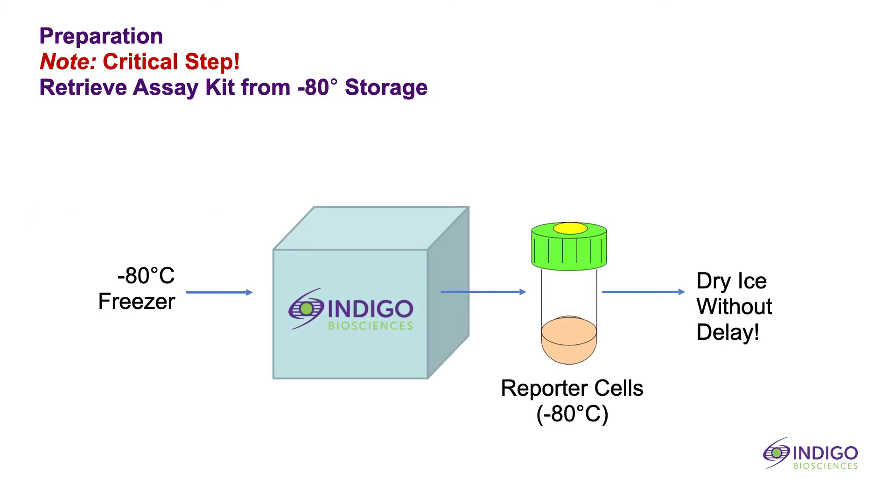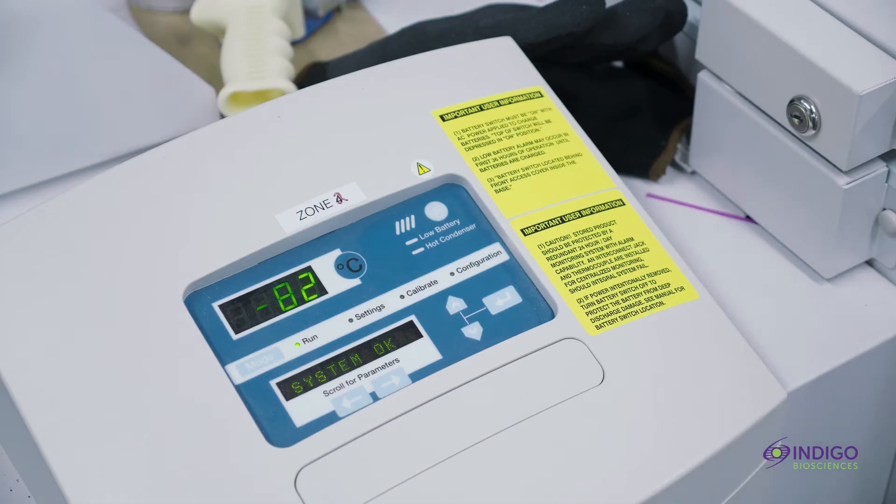The day one workflow begins with retrieving the assay kit from negative 80 degrees Celsius storage. This is a critical step because the reporter cells contained within the kit box are temperature sensitive. Use a sharp instrument to open the tough plastic bag, then carefully cut through the seal in the kit lid. Without delay, retrieve the tube of reporter cells from the kit box and submerge it in dry ice. Work quickly so that the tube of reporter cells does not warm up significantly above negative 80 degrees.